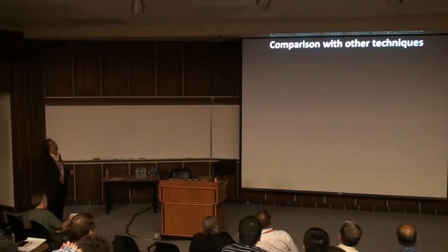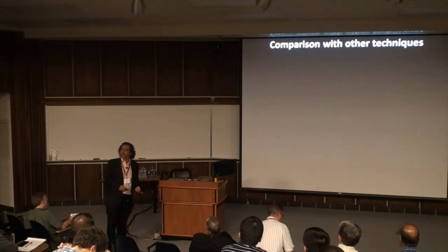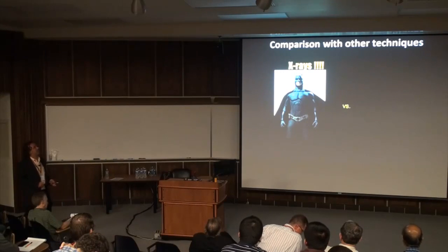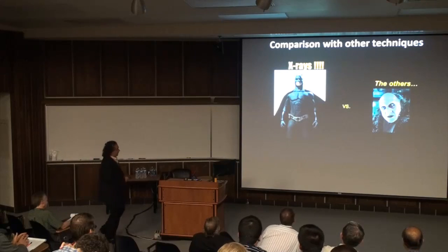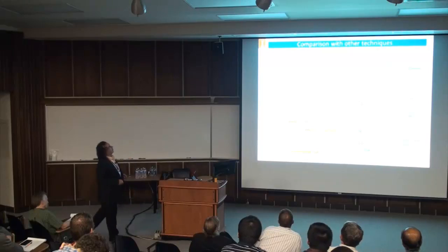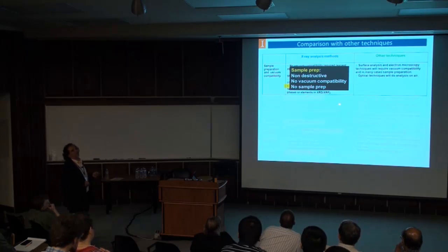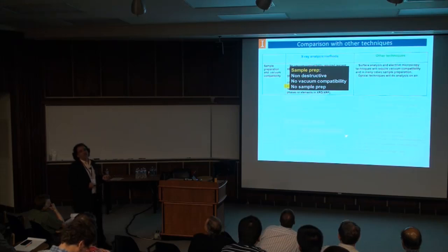Now, good luck going out there and finding on a regular basis some technique that can measure 2 nanometers for you. All right? Let's compare X-ray with other techniques. How does X-ray do? Is it good, bad? I'm going to be very impartial and neutral here, not pushing towards X-ray, compared with the other ones. I'm not going to have you reading this. Just quick: very little sample preparation. In other techniques, you almost have to bleed to death to prepare the samples. TEM, for example. X-ray, very minimal preparation.